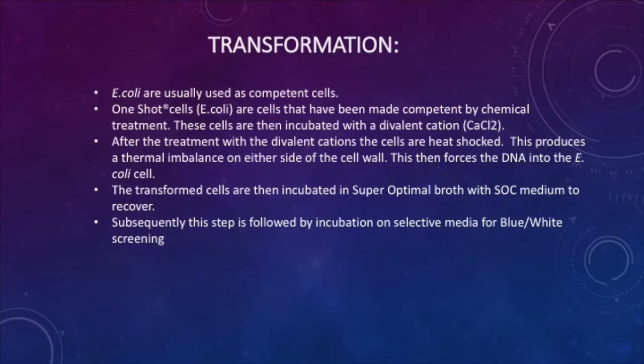This then forces the DNA into the E. coli cell. The transformed cells are then incubated in superoptimal broth with SOC medium to recover. Subsequently, this step is followed by incubation on selective media for blue-white screening.